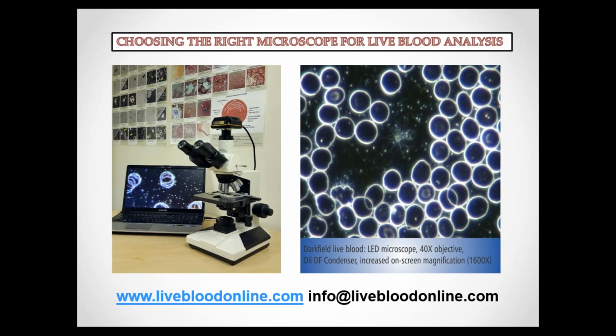So it's about being able to see the blood cells and the plasma, which is what the blood cells are suspended in, and the background as well as just the blood cells. Is that right?